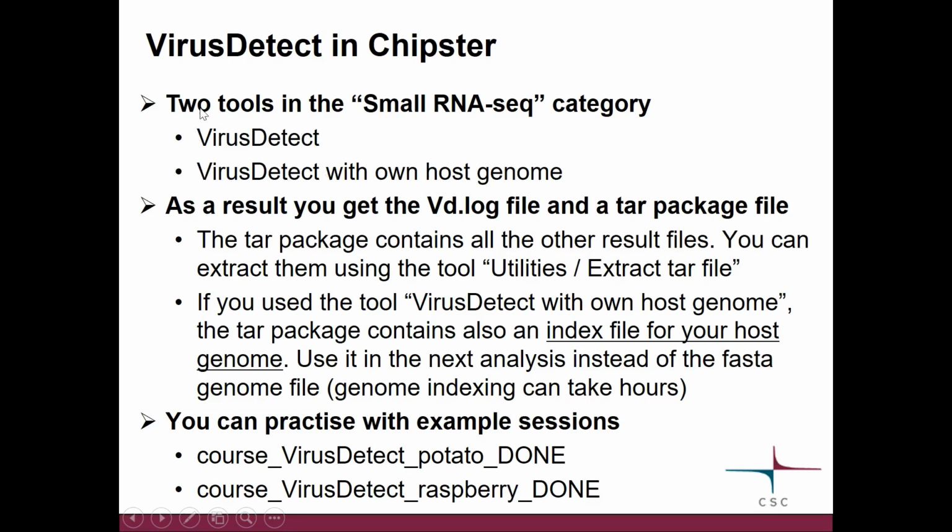So in Chipster, when you run VirusDetect, you essentially get two files. One of them is a log file, the one that I was just showing to you, and the other one is a tar file. A tar is a package of files, actually.